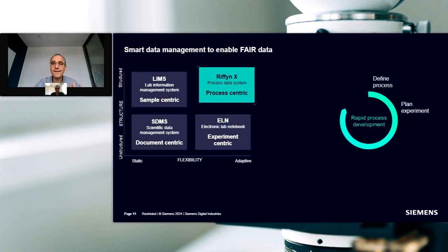So it's really around planning your experiment, doing your DOE, your design of experiment, that will define what is necessary to be tested from the very early stage of what you know about your process. Sometimes it's just the active ingredient or just the extraction around your active ingredient or the very first step that you need to assemble based on prior knowledge. Of course, you will go through your experiment and capture the data.